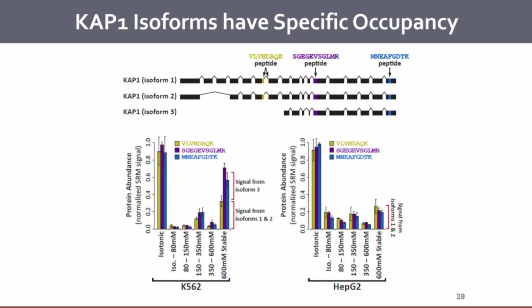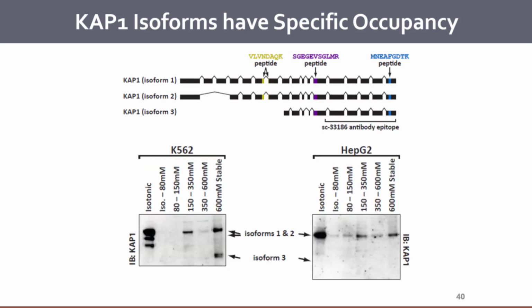You should not expect peptides to change in the same direction across different samples. There are different proteoforms. Often, whenever we've dug in deeply to try to understand why different peptides are disagreeing with one another, it's actually always been interesting. There are a couple of people in the lab trying to look at whether they can use co-expression of individual peptides to come up with peptide grouping within individual protein groups. But that's still kind of a work in progress.